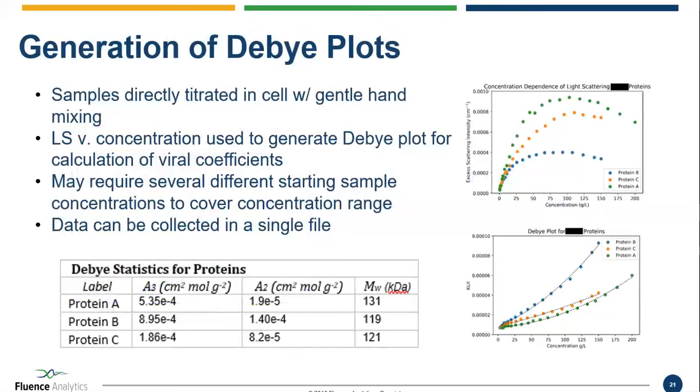Another thing you can do at the start of the data collection is to go ahead and prepare samples at a few different concentrations, and you'll transfer those in at the given point, and continue on with the titration work.